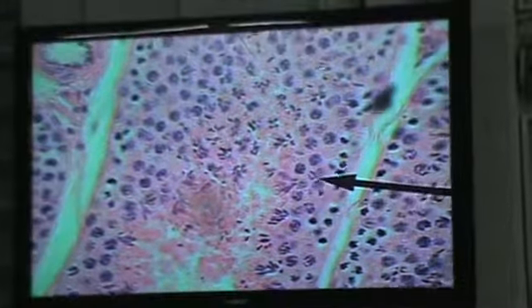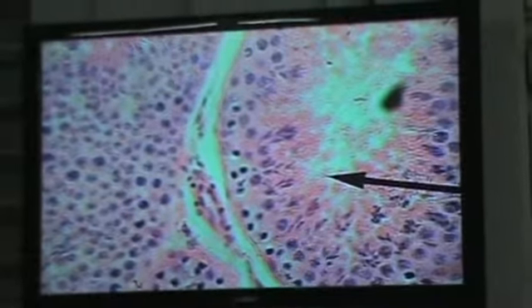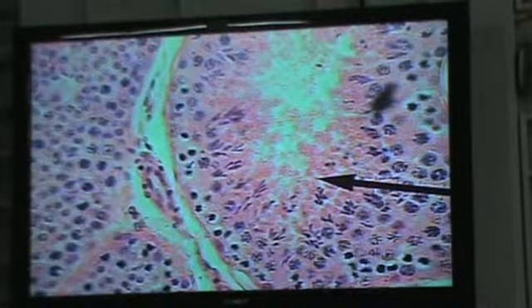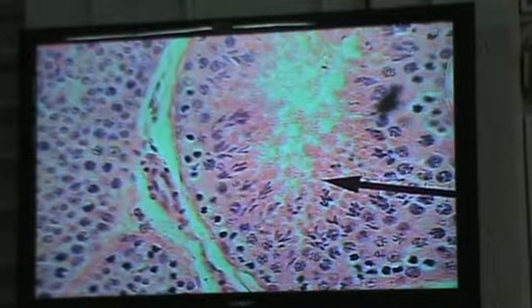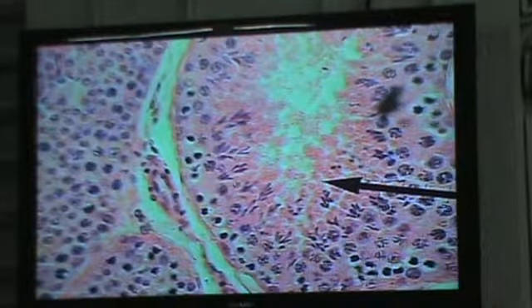And there you can see a lot of cellular division occurring right here. So all of these boys here now, we're getting a reduction in chromosome number. So these boys here now, these are spermatocytes. We see basically the spermatogonium, the spermatocytes, and then we see the spermatids. This testis is from a rat. And in a rat, what we get is what's called a wave of spermatogenesis.